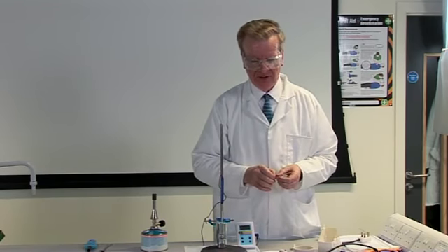Since the melting point we have found is very close to that quoted in the chemistry data books for the melting point of pure benzoic acid, we conclude that the recrystallization experiment has worked. That is, it has given us pure benzoic acid.